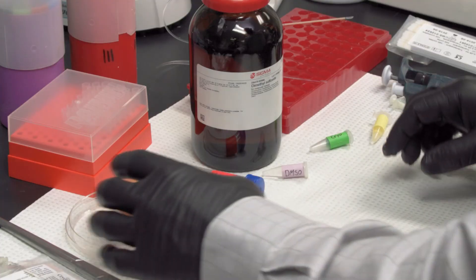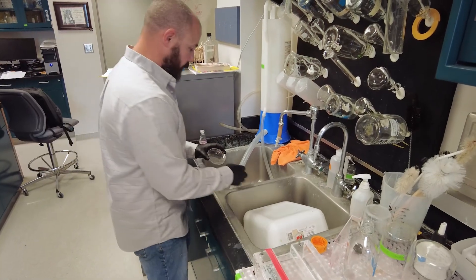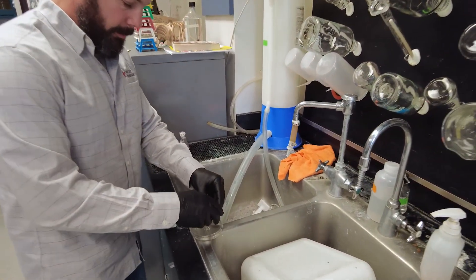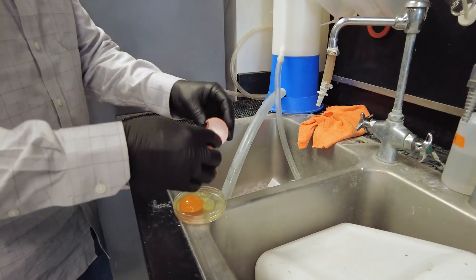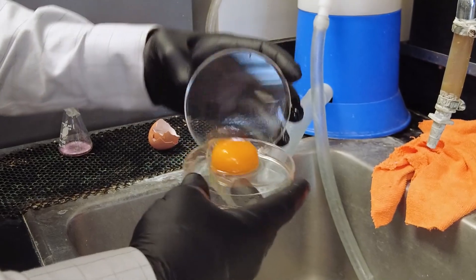There is great interest in finding replacements for or ceasing the use of egg yolk because it is a biological material with its own set of highly variable components. But for now, we are still utilizing it as a component in our cryopreservation protocol.